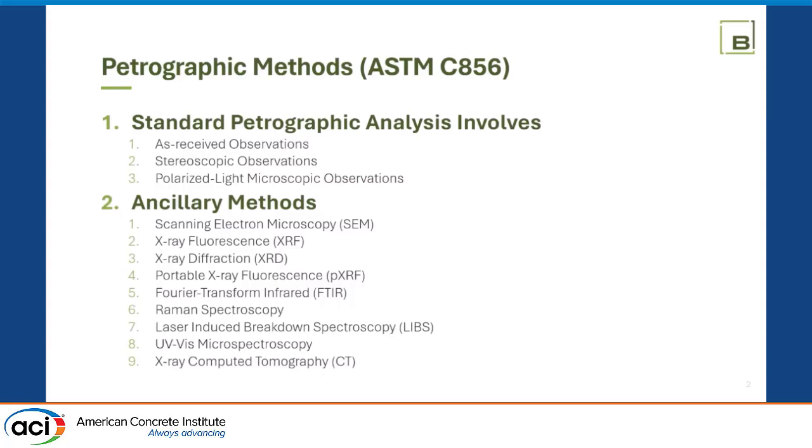Laser-induced breakdown spectroscopy is another thing that I've been playing with. It's a nice fast analysis. You can do it right here in the room. You don't need vacuum chambers or anything like that. You can get elemental analysis right here, right now, in 60 seconds or less. UV-vis microspectroscopy is something else I've been playing with. It's just a fun little toy that I have not fully utilized yet. And then we have X-ray computed tomography that I've been playing with as well.